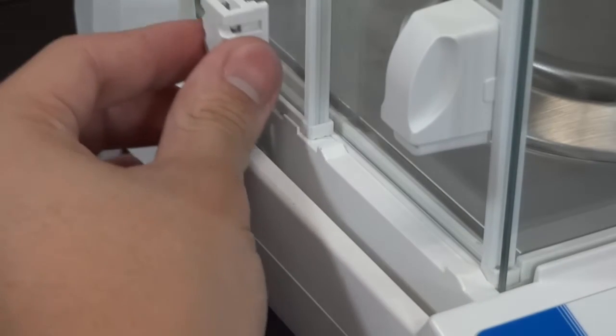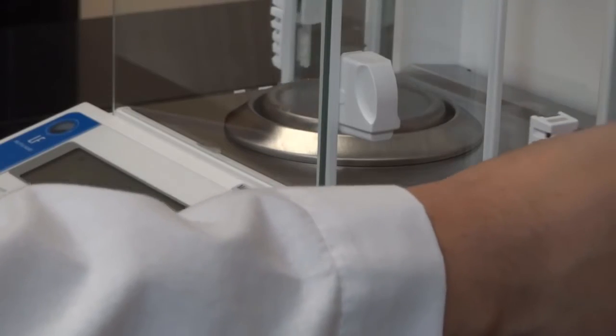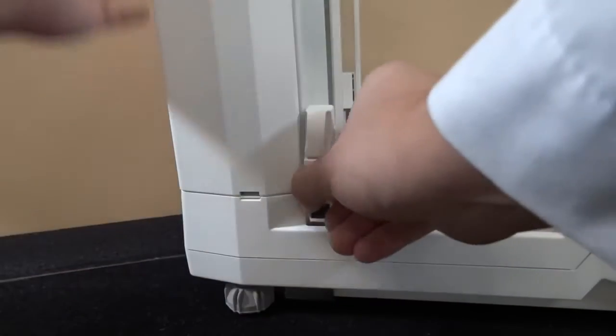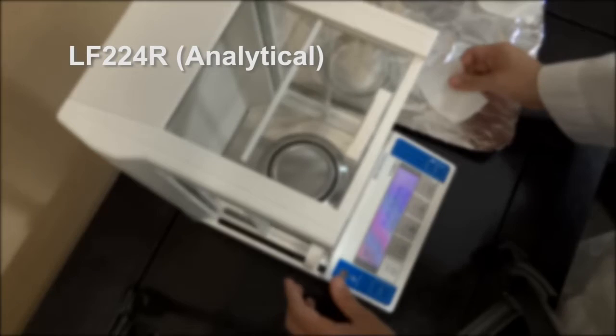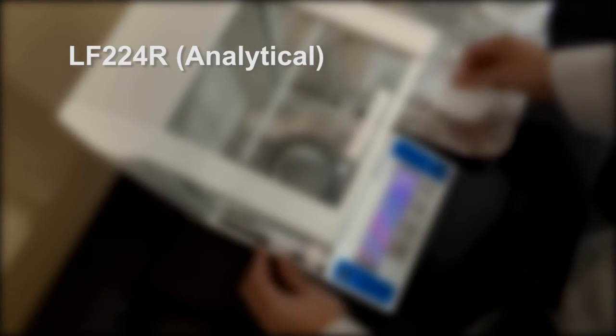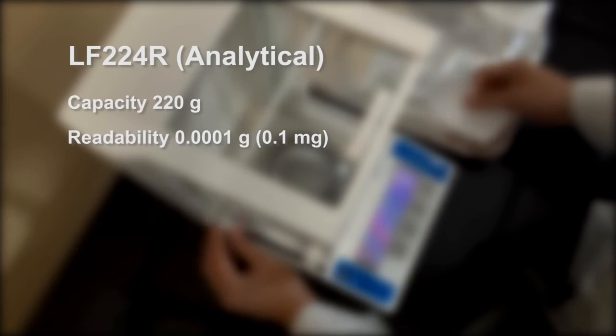All three glass doors are split nesting, meaning that they will not protrude outside the shell of the casing, thus saving space and guarding against accidents. The LF-224R offers analytical weighing at a tenth of a milligram.